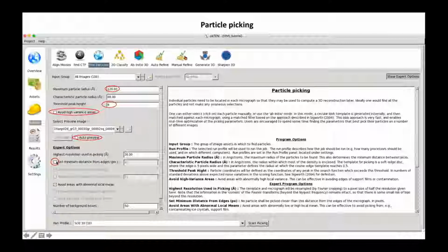And then you can, in real time, follow what each parameter you are changing is doing. And here is also, I wish we could do it here and see the difference, because I played around and I've seen it very nicely. If you check this, you can play with the distance from the edge of your micrograph that you're going to exclude for particle picking.